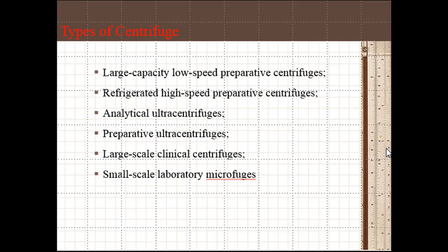Types of centrifuge. Different types of centrifuge available: large capacity low speed preparatory centrifuge, refrigerated high speed preparatory centrifuge, analytical ultracentrifuge, preparative ultracentrifuge, and large scale clinical centrifuge.